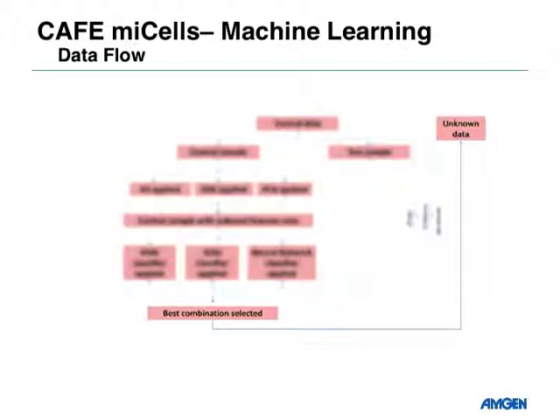And the thing that's nice about this program is it might be that you have 1,000 cells in your control wells. What it does is it randomly chooses cells within your control population. So it's trying to take the user bias out of saying, this is obviously my control cell. It lets the statistics talk for themselves and separate out these different populations. And then, after you find the classifiers and the best way of separating these, you use this on your own data.